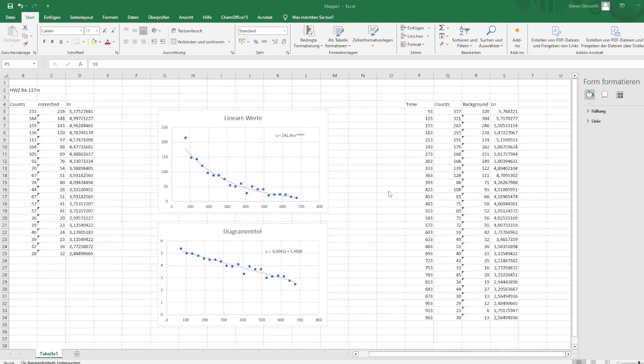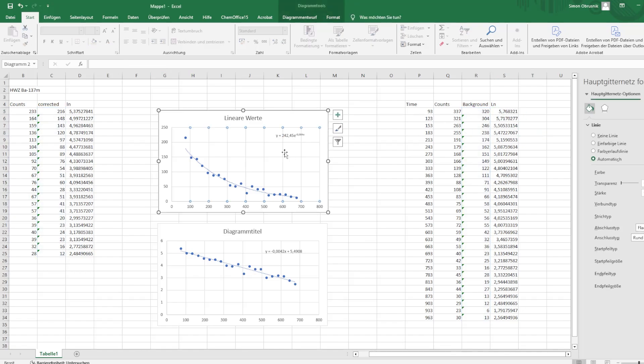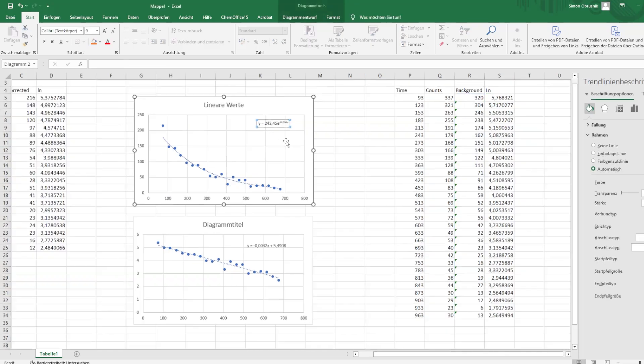So, welcome to Excel. Here we have the data: counts and background. In my case, the background was 17 counts per 20 seconds. Then the values are logarithmized using this formula. Insert everything into the table and display a linear equation and x will be your decay constant.